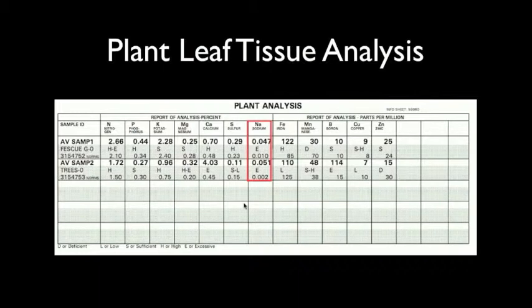Well, in this particular case, we have 0.051 is what the sample has. Yes. But the amount that it's supposed to have is 0.002. It shouldn't have more than that. This would be like saying, I know you would enjoy having one hamburger, but you have to have 25. Right. It's going to make you sick. Right. So it's going to be incumbent on a landscape manager to look at the data and say, okay, this is something that I need to be aware of and I need to start working on, otherwise it's going to be problematic in the very near future.